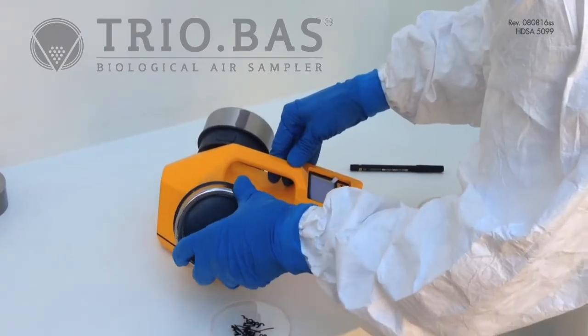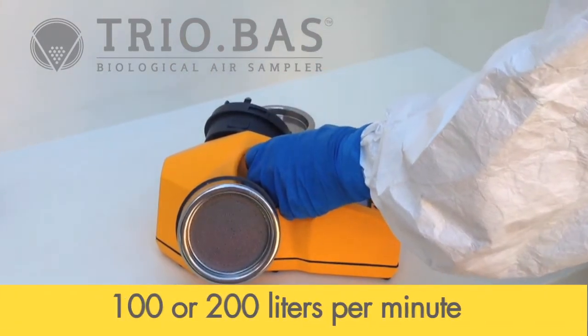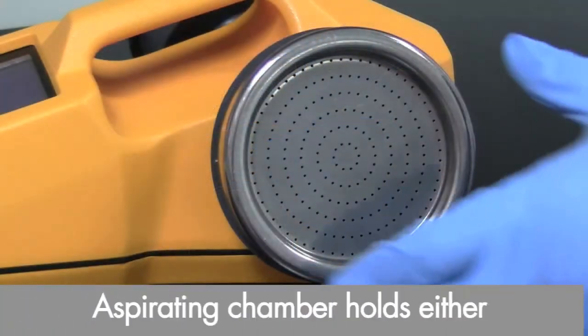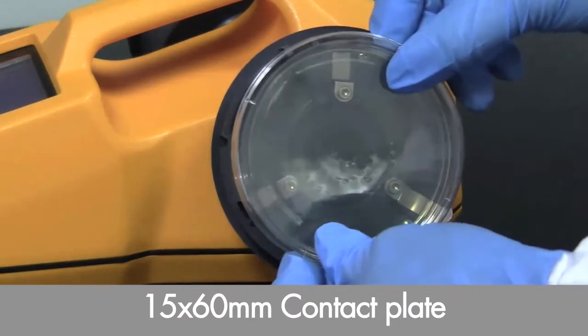Your TrioBoss Microbiological Air Sampler has been calibrated to sample at a flow rate of either 100 or 200 liters per minute. The aspirating chamber holds either standard 100mm auger plates or 60mm contact plates.